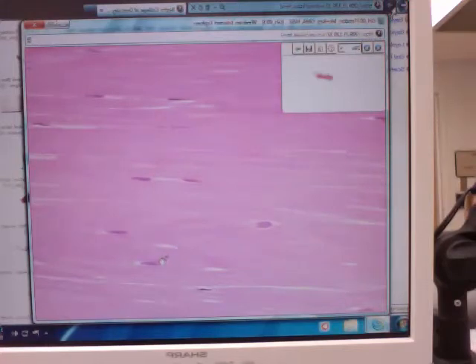Dr. Spears, sometimes it looks like muscle to me when it's from a different magnification. Well, have we had muscle yet? No. Okay. Later, I will tell you, you might get it confused with smooth muscle, but at this point, we haven't had muscle. You won't get it confused with smooth muscle if you ask, where are the individual smooth muscle cells? I don't see any cells. And all the pink, it's just all collagen fibers, bundles and bundles with some scattered fibroblasts or some bigger nuclei that you could maybe believe. But if you look at it as a whole, it's definitely dense, regular. And nobody has to know anything about muscle right now, so don't call it a muscle.